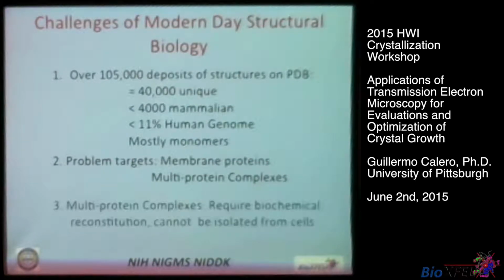The most problematic targets are membrane proteins and multiprotein complexes. The problem with multiprotein complexes, for example, is that they require biochemical reconstitution and cannot be isolated from cells, so they pose an extra biochemical problem.